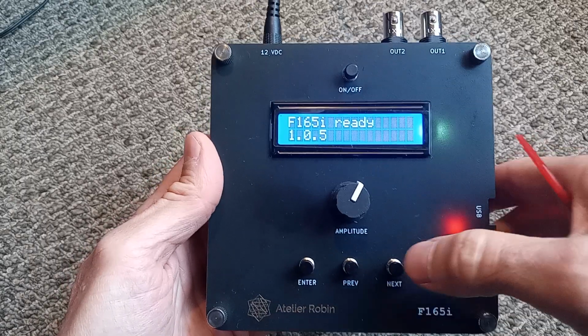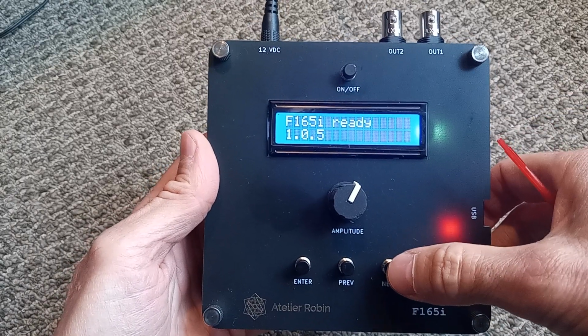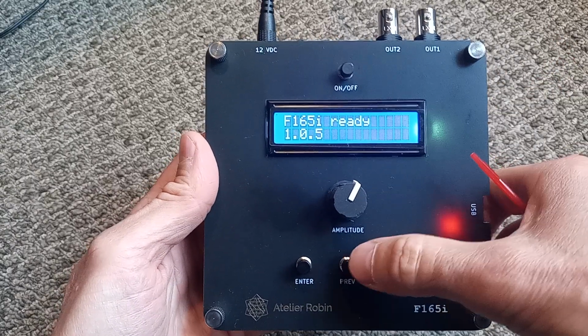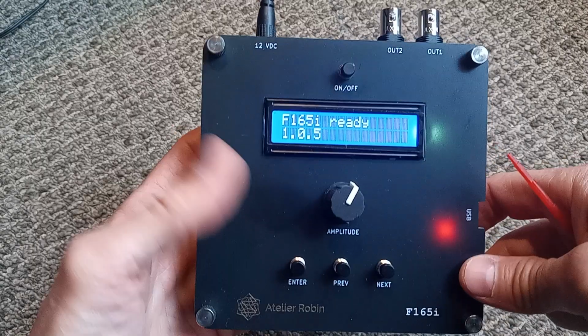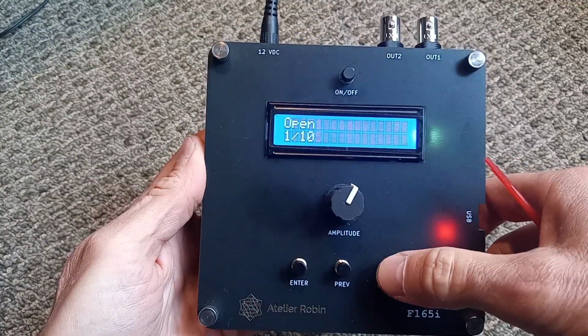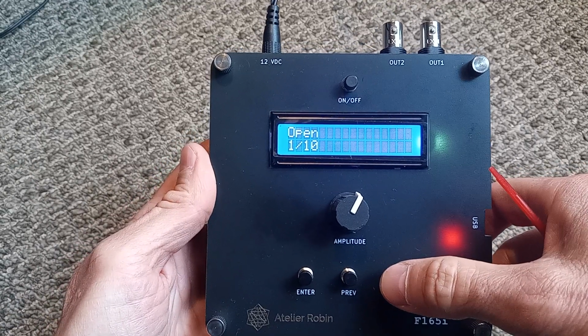those three buttons here. So you have different menus available, and the first menu that's available when you turn on the unit is the main menu, and you can navigate the menu with the previous and next button, and you can select an item in the menu with the enter button. So if I can show you here what the items in the main menu are.